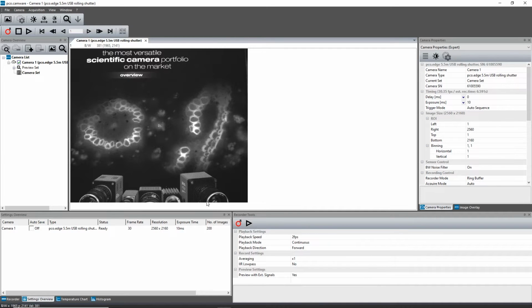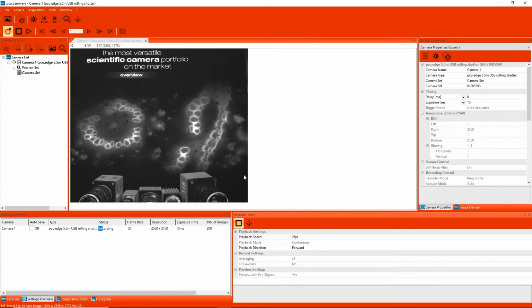This video explains how to save single images during an active record or live preview. You can save single images on your hard disk even if your camera is actively recording or you are looking at a live preview window. To ease the workflow, we have introduced a nice little feature which is available by simply pressing the Insert button.